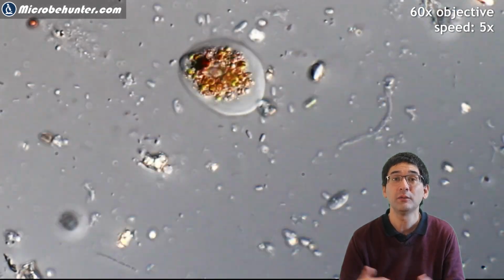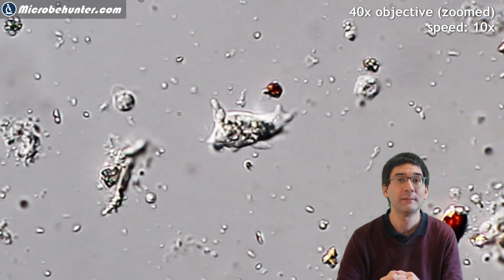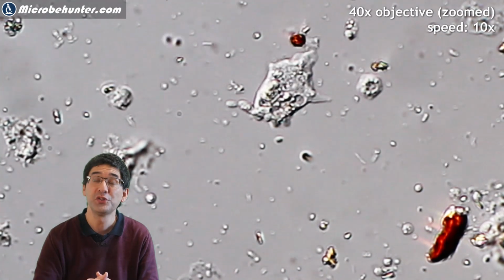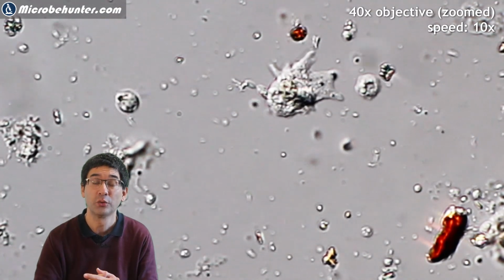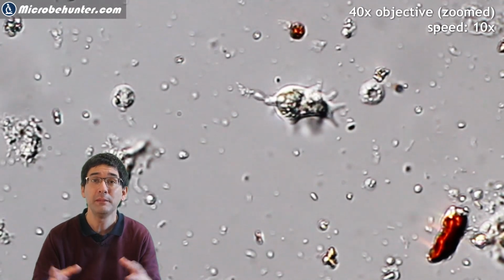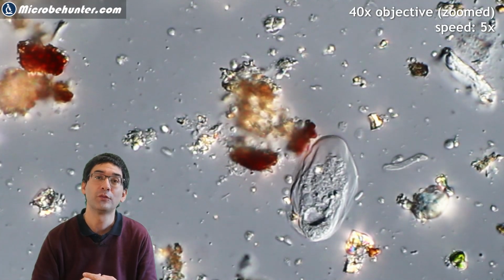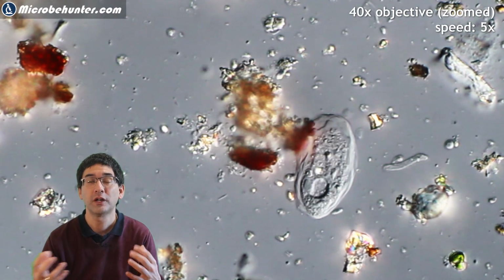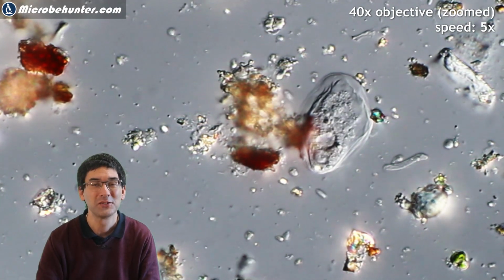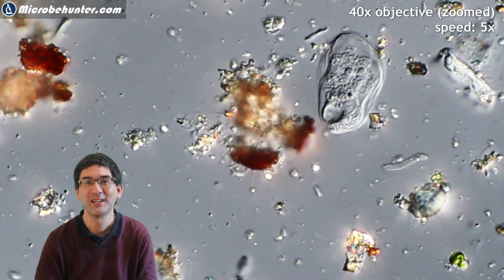Yeah, and that is basically one of the fascinating things, when you look around carefully, then you can find all sorts of different types of microorganisms and amoeba that move around in a different way. You have to of course also know that amoeba is not just one class of organisms, but you can find them among the fungi. Apparently even some plant cells move like amoeba, also our white blood cells, for example, in our body. So it's not one single class of organisms, but actually from a variety of different backgrounds. So this means just because you see two amoeba does not mean that they're related, but that's a little bit of biology. Here, this one very, very nice. You can see also the cell organelles.